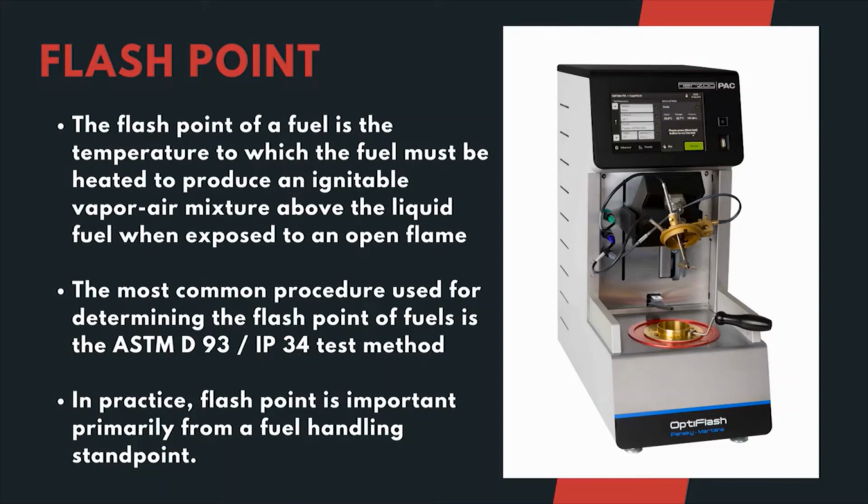For example, you may continue to heat it. At a lower temperature level, the air-vapor mixture will not get a flame, but at a particular temperature the air-vapor mixture will get the flame.